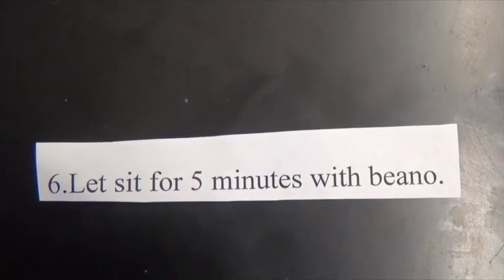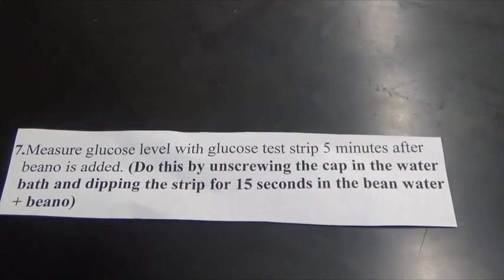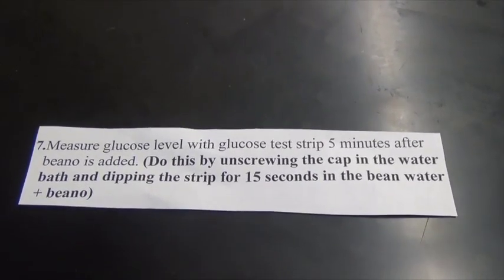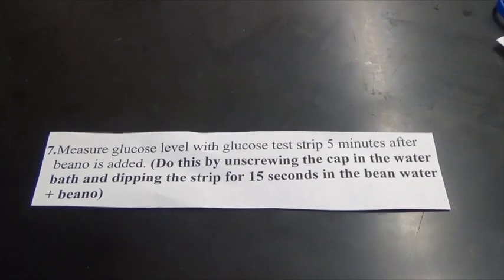Number six. Let it sit for five minutes with Beano. Number seven. Measure glucose level with a glucose test strip after five minutes after Beano is added. Do this by unscrewing the cap in the water bath and dipping the strip for 15 seconds in the bean water plus Beano.